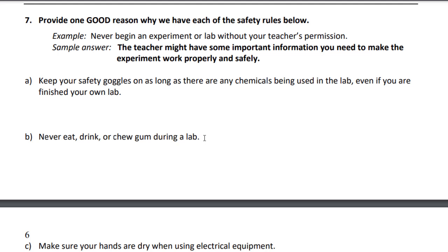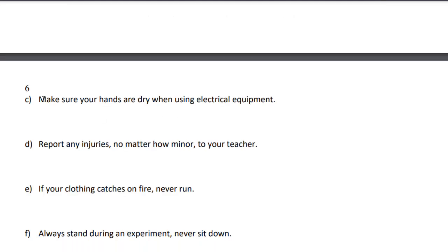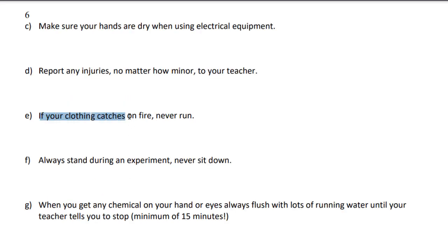And we will make sure that we are perfectly cleaned up after lunch before we start any kind of a lab in the afternoon. Common sense. Why would you want to make sure your hands are dry? Have you ever been shocked before? It's not fun. Clothes catch on fire.